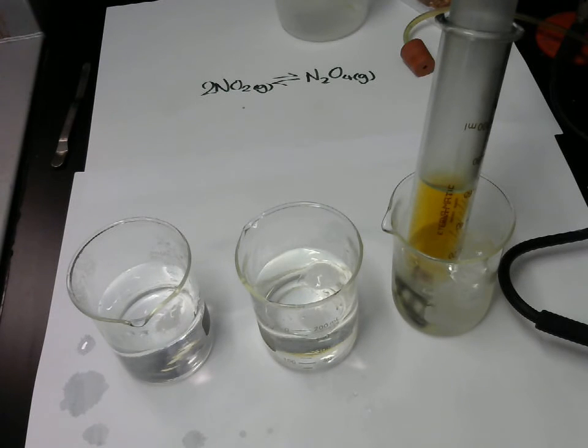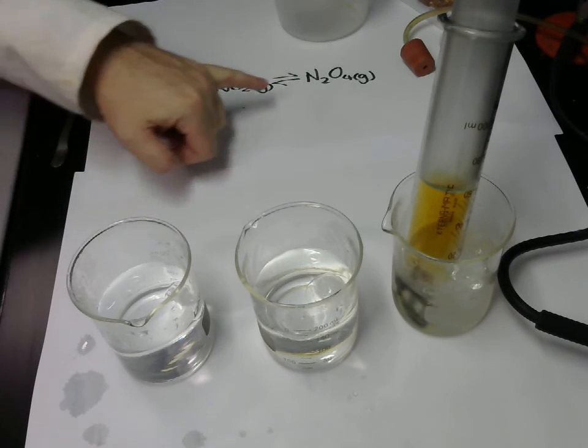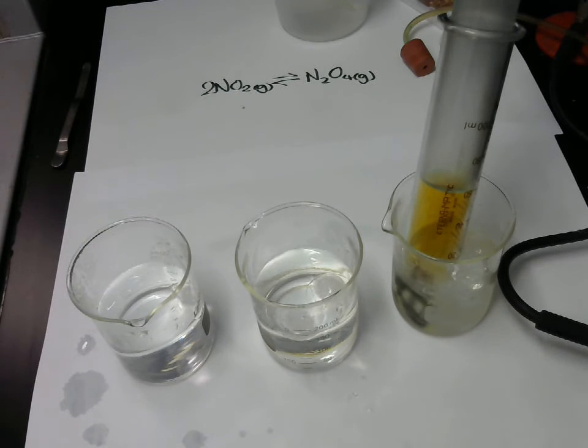So we can look at changing the system a little bit and see what effect it has on an observable change like colour. Link that to our chemical equation, and that allows us to work out which direction is exothermic, which direction is endothermic, and we can justify those colour changes based on, for example, the number of gaseous particles, the pressure one.